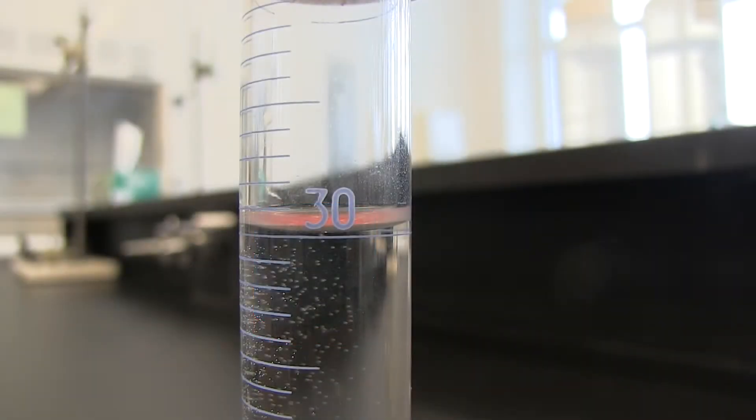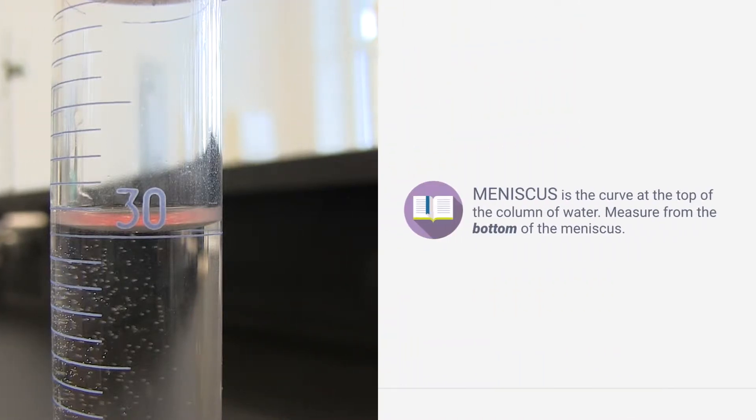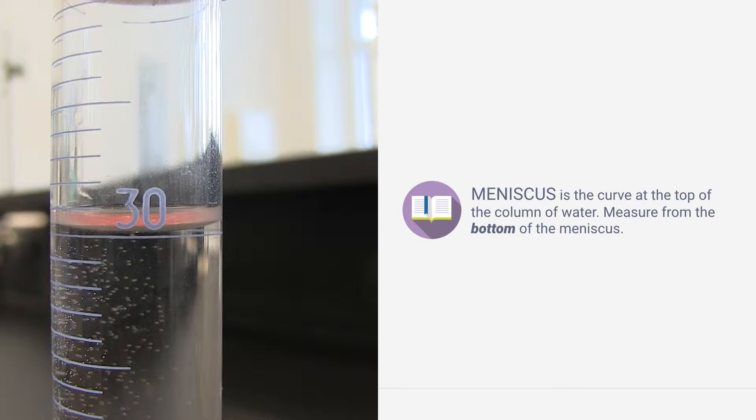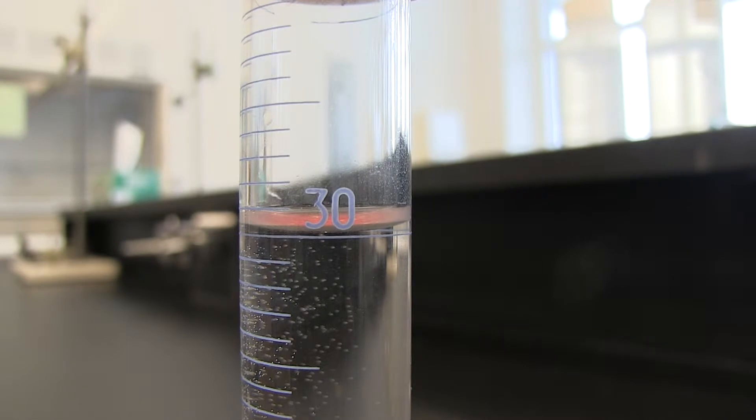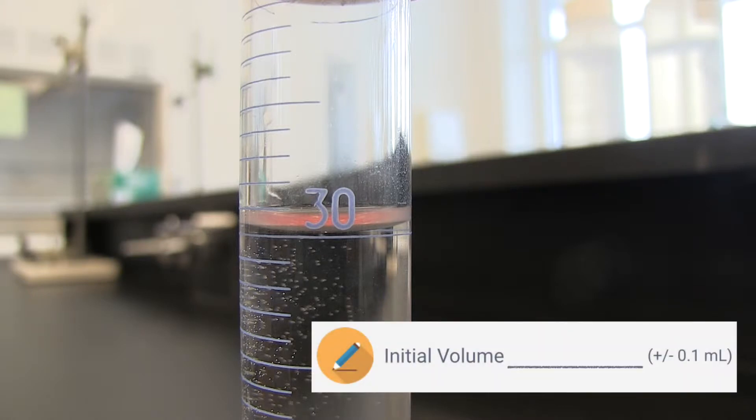One more thing, you need to know what a meniscus is. If you look at the column of water in the cylinder, you'll notice that the top part is curved slightly. This curve is called the meniscus. When you do your measurements, make sure to measure from the bottom of the meniscus. So for this example, 30.0 milliliters is our initial volume.